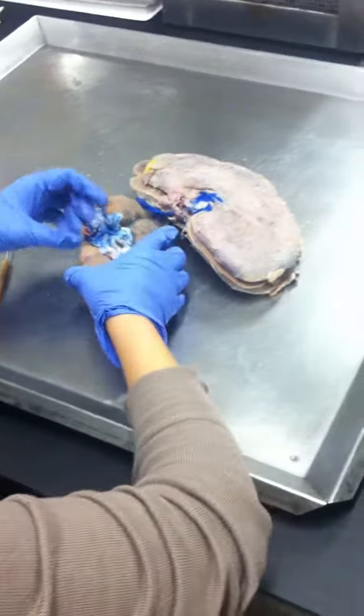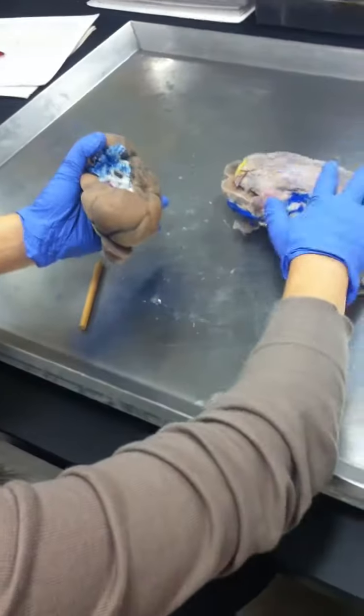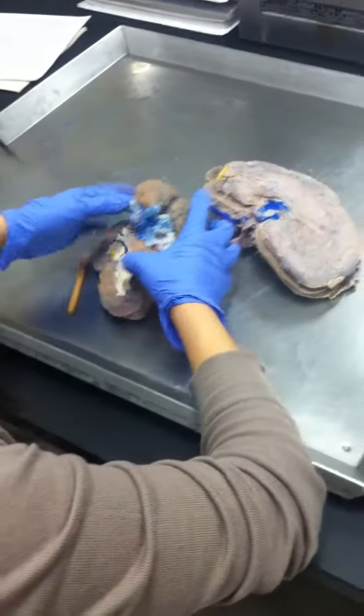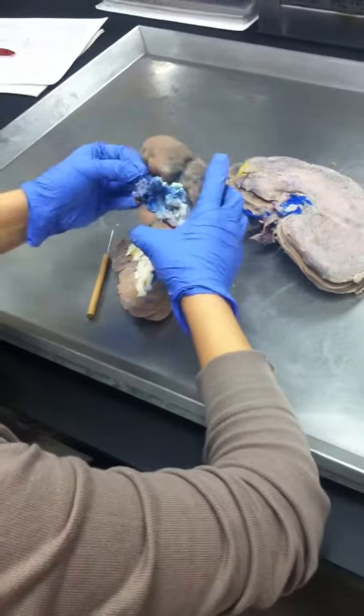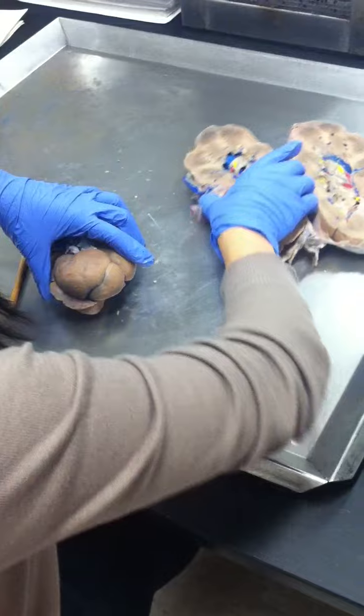What kind of kidney is that? It's either a calf or a sheep. One of them is a sheep and one of them is a calf. So I think maybe this is the cow one. This is huge. Crazy huge. All right. Ooh, and this is the inside.